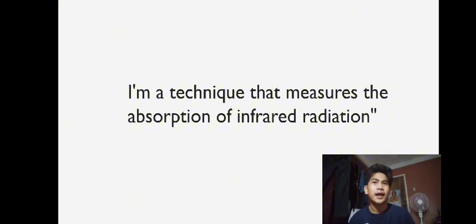Lastly, I am a technique that measures the absorption of infrared radiation. Very easy to answer. The clue is in the sentence. Yes, the answer is infrared spectrometry.